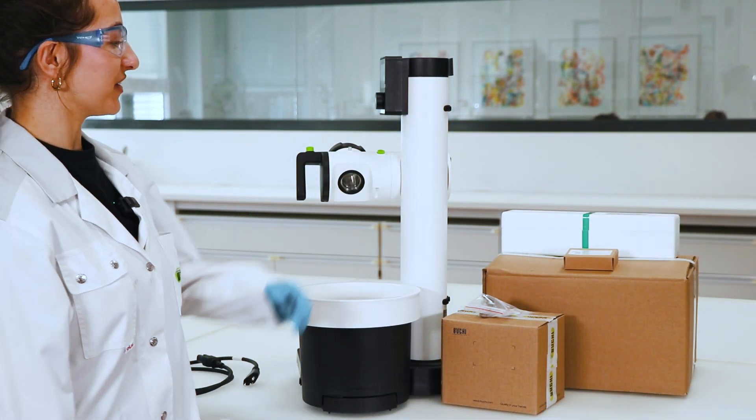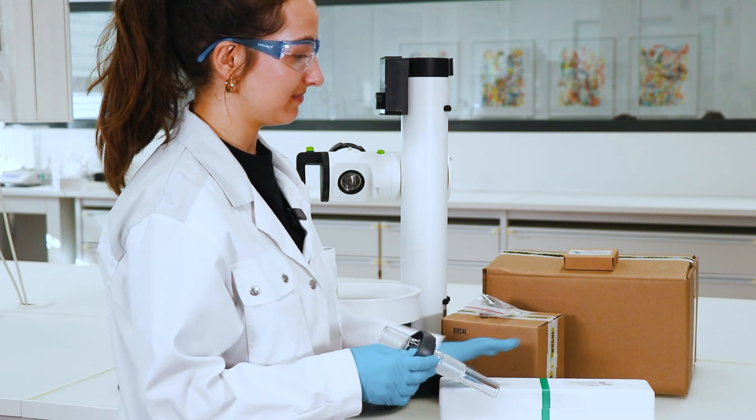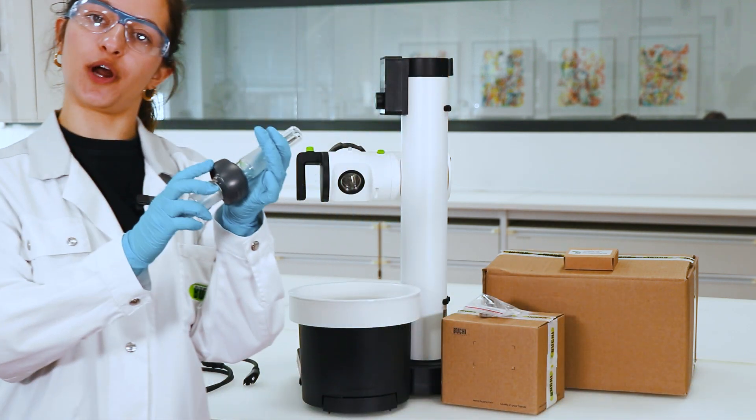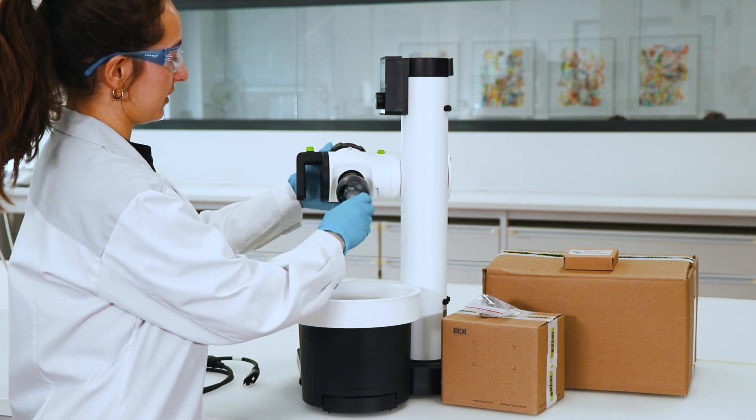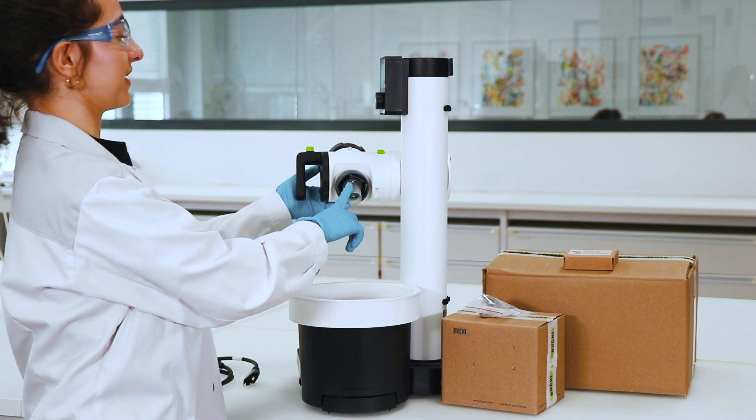Okay, so the first thing you do is you install the vapor duct. It comes with the combi clip, so you just insert it here. And when you hear this click you know you've inserted it correctly.